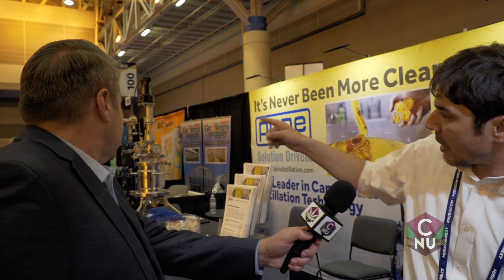These systems grow really quickly, and what we're finding now is this smaller one is almost becoming too small for just about anybody — basically turning into a toy. This one over here is a six-inch still, which is about six times the surface area of this one here, and that's becoming basically the mainstay. The process is about four or five liters per hour. Every hour I'll get a phone call and probably sell one of these things. The CBD oil industry is not going away — it's booming.